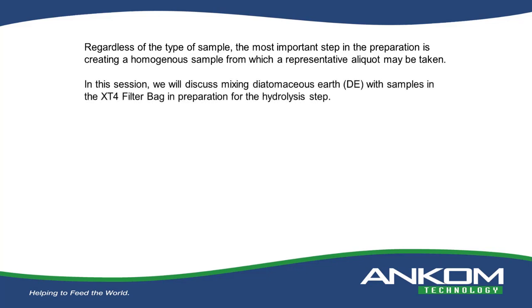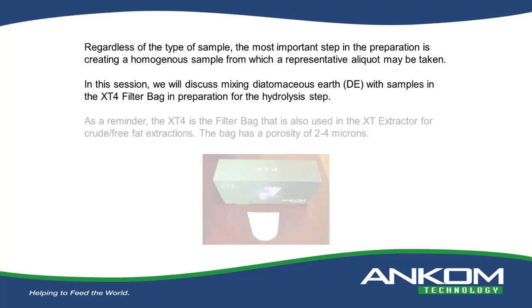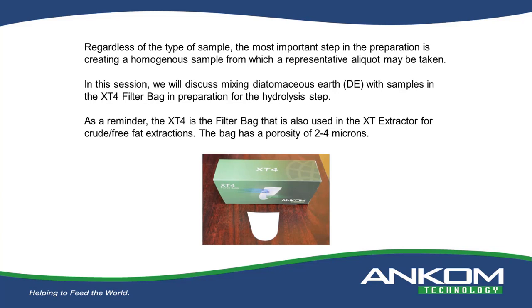In this session, we'll discuss mixing diatomaceous earth, or as I'll refer to it, DE, with the samples in the XT4 filter bag in preparation for the hydrolysis step. And as a reminder, the XT4 is the filter bag that is also used in the XT extractor for both crude and free fat extractions. The bag has a porosity of 2 to 4 microns.